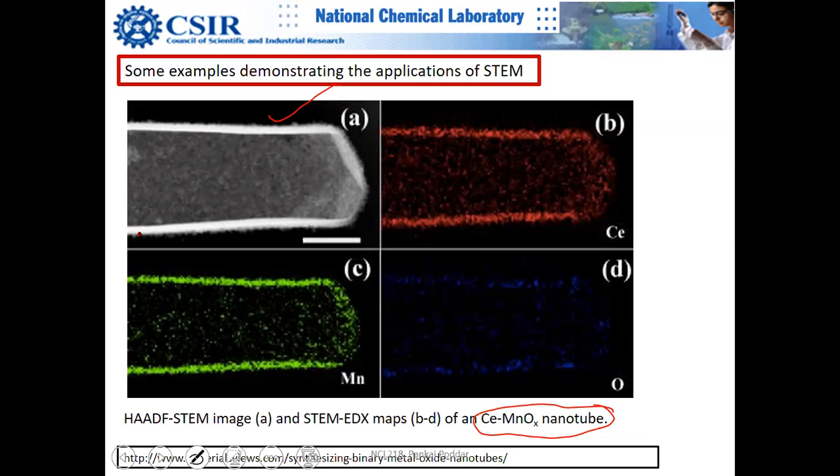Suppose you have one point here, another point here, the same point, you can correlate. So you can zoom this area, and zoom this area. You can match which atom is where and what is here. For example, you can correlate at the same position. You can capture the information actually.